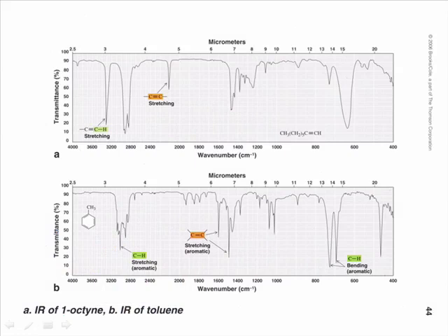All right, so in our IR spectrum here, the first IR spectrum is that of 1-octyne. So this is an alkyne, and in this spectrum we can see this vibration at about 2200, which comes from the alkyne triple bond. We notice that this vibration is relatively strong, so it's not a weak or almost non-existent one that we've seen before, because this is the terminal alkyne.